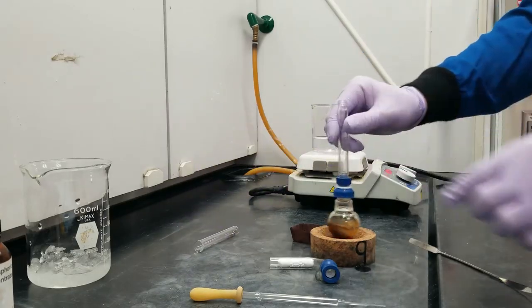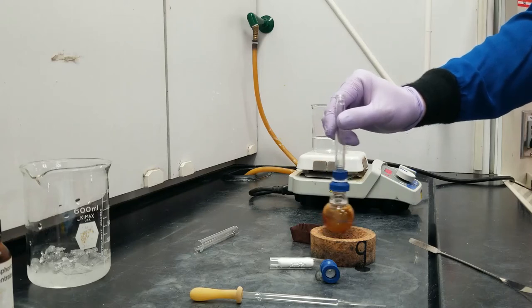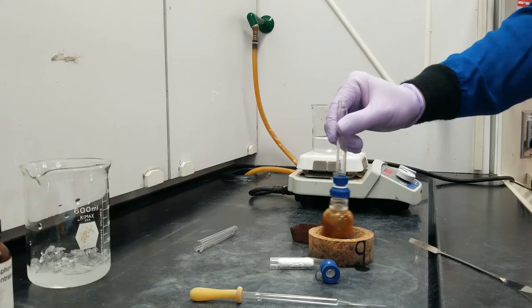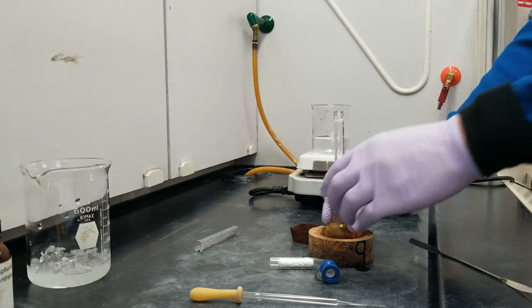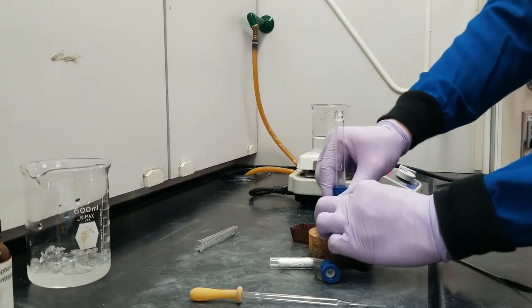Stop the reaction completely by eliminating one of the reactants. Alright, and with a quick swirl, all of that acetic anhydride has been used up. Alright, let's take this guy off.